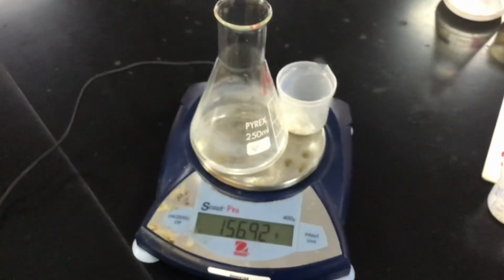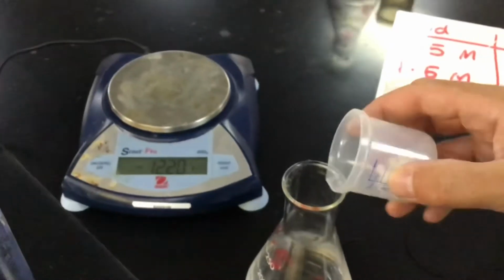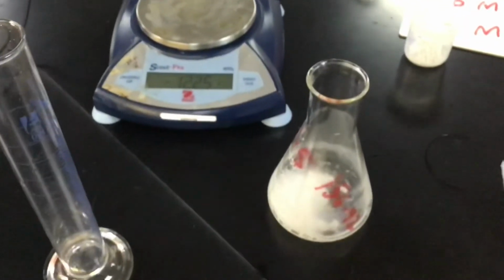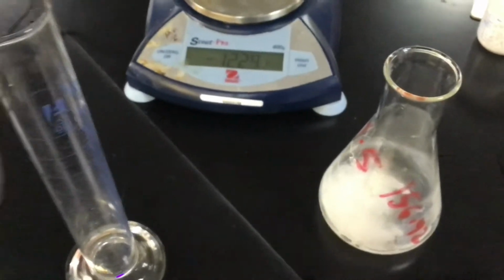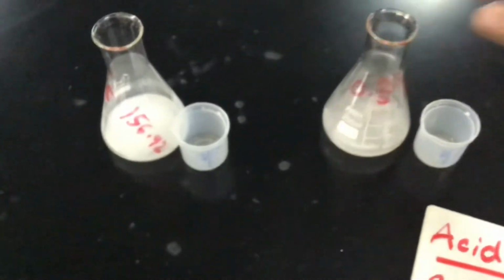This one is 156.92. I'll write that on there. So there we have 156.92 for those two. So we'll put those together. See the reaction. You probably notice it's a little bit more vigorous than the previous one. We will put that over there together, leave it going. And notice the first one is starting to finish up its reaction now. And then the last one, we've done the 1.5 molar, put the lid back on.